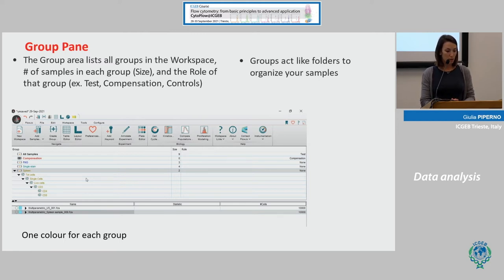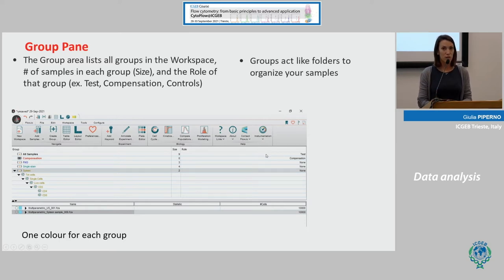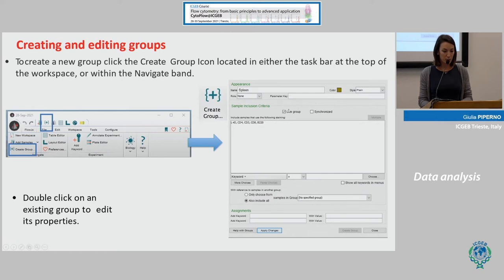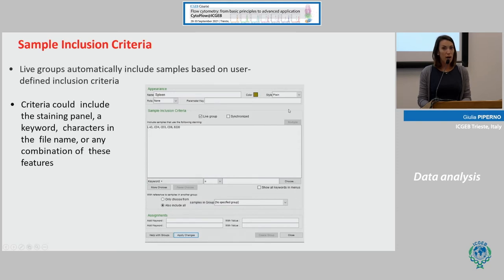The group pane is a list of groups in the workspace, showing the size of each group. You can also give a role to your groups, such as test, compensation, or positive and negative controls. These groups act like folders to organize your samples, and you can also create subfolders and assign one color to each group. To create a group, click on the icon located in different positions, and a window will open where you can change the sample name — in this case it was 'spleen' — change the color, and assign a role.